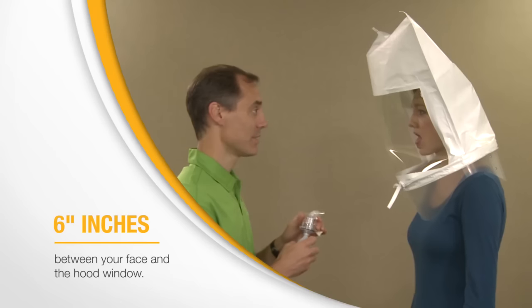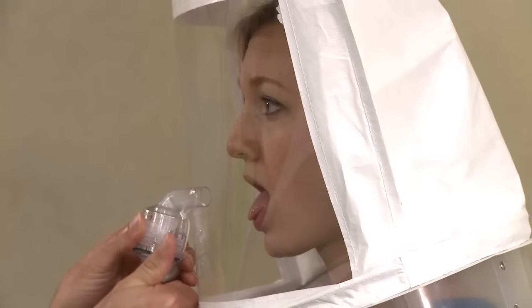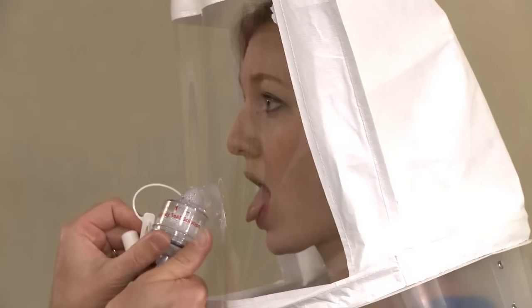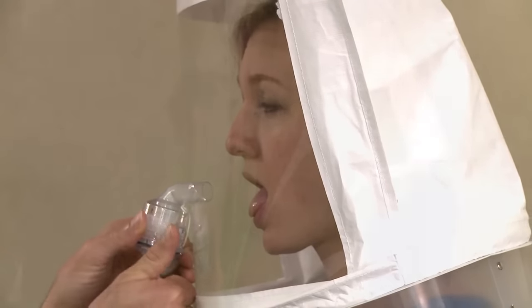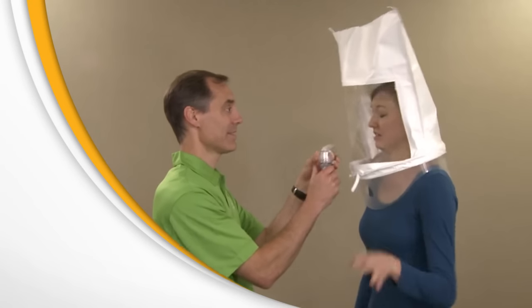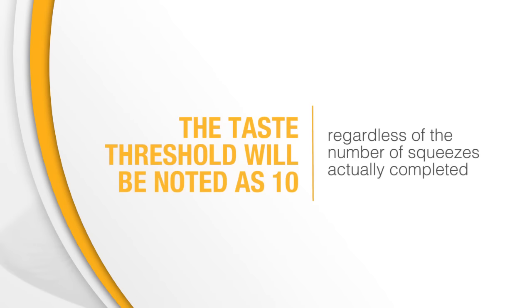Using nebulizer number one, containing the sensitivity solution, the instructor will initially spray 10 squeezes into the hood through the hole in the window. You must breathe through your mouth and extend your tongue slightly. If you taste the test agent at any time during the 10 squeezes, tell the instructor. The taste threshold will be noted as 10, regardless of the number of squeezes actually completed.